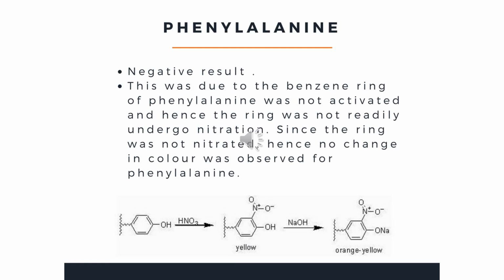Phenylalanine gave rise to negative results. The reason was probably that the benzene ring of phenylalanine was not activated. Thus, the ring did not readily undergo nitration. Since the ring was not nitrated, no change in color was observed for phenylalanine.